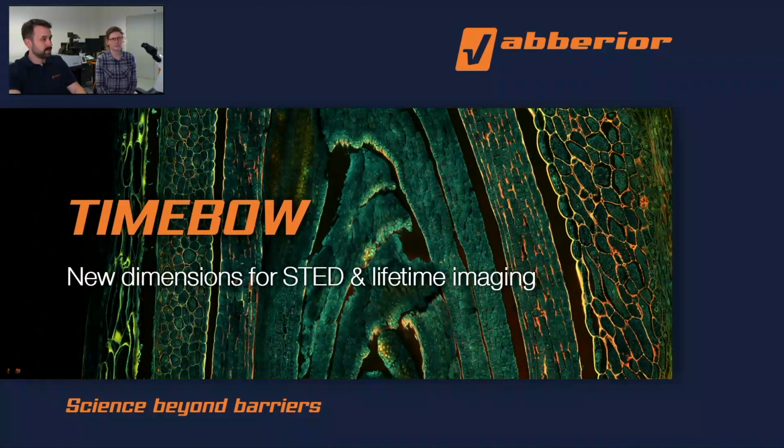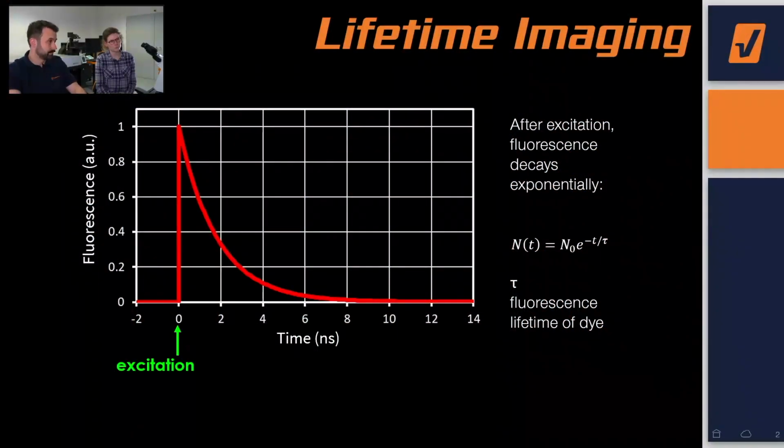Since I promised you that lifetime imaging is really easy with TIMEBOW, I'm going to keep the introduction to a bare minimum. In essence, we have a pulsed excitation laser that excites dyes into an excited state. From that, they can send out a photon, which we can detect with our single photon detectors, which are time resolved. Why time resolved? Because over time, more and more fluorophores return to the ground state. We get less and less photons being sent out. We get an exponential decay of fluorescence over time. And we're looking here at the nanosecond time scale.